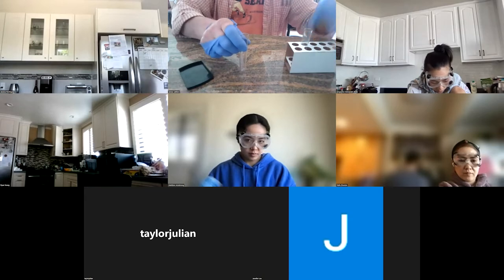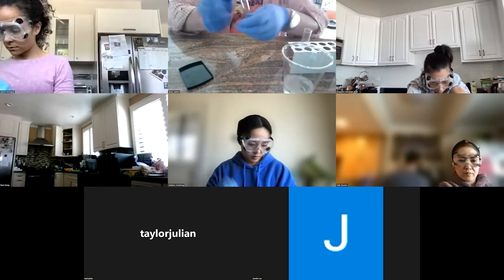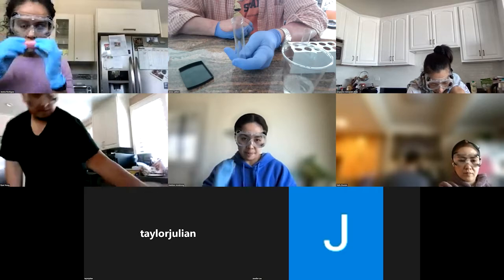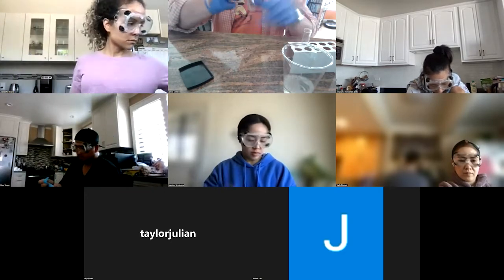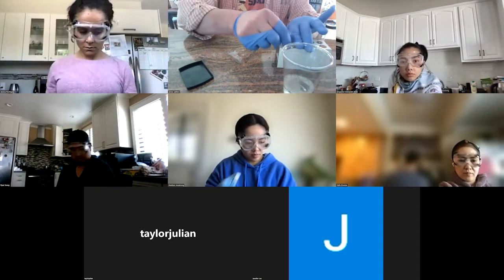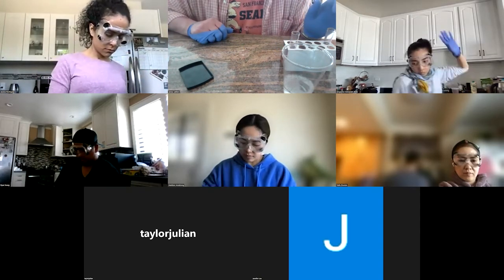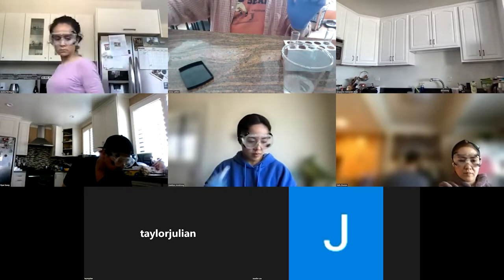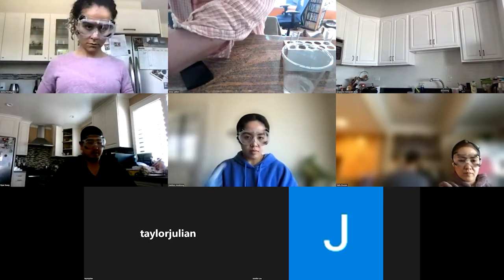So back to my soap solution. I've got a test tube. I think you can use either the plastic test tube or the glass test tube. It really shouldn't matter. And take 5 mils out of there.